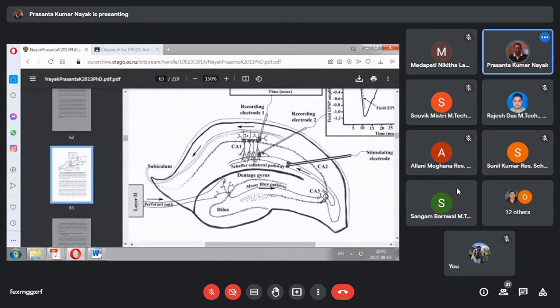Sir, are you talking about TS or LS? It is TS. Whatever you can see at the moment, you just add on like this. This image you are looking at, you just add the slices like this, so it will be a long structure, like a banana. Just as when you cut a banana, it looks like this from the front. You see there are actually seeds arranged in a banana slice.